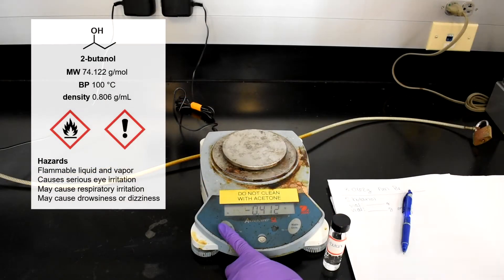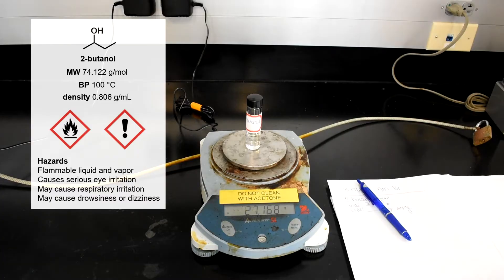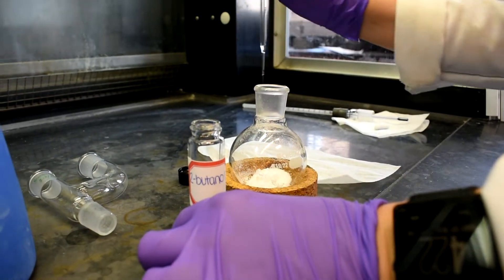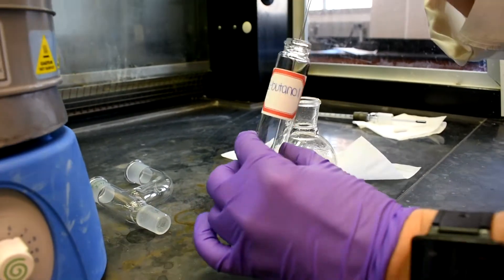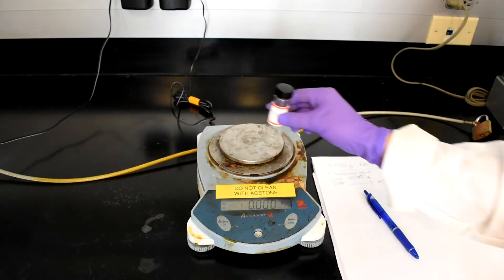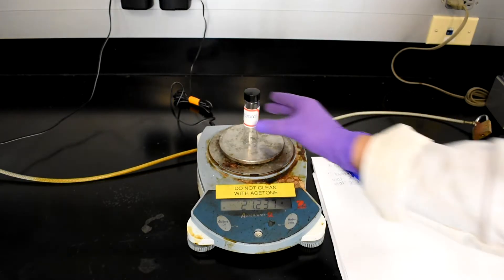Obtain one of the pre-measured vials of 2-butanol. Zero out the scale and then add the vial. Write the weight of the vial and make sure your TA signs this weight. In the presence of your TA, weigh the empty vial that contained the 2-butanol. Zero out the scale and be sure the vial is the same as before, meaning with or without the cap. Write down the weight of the vial and have your TA sign this value.